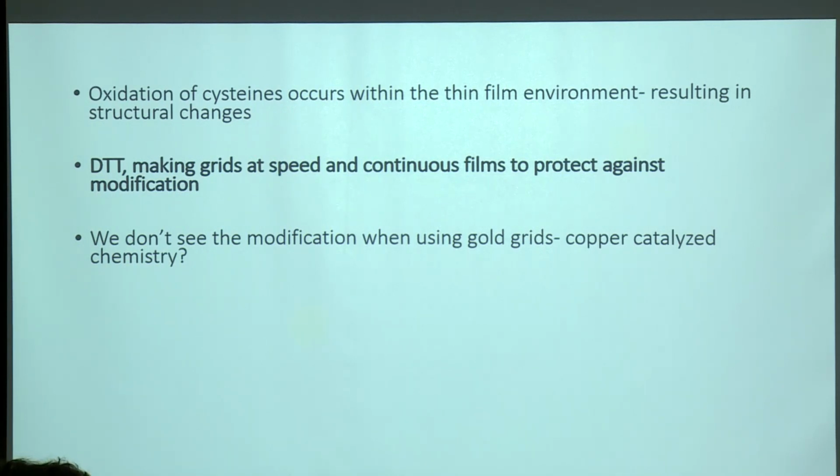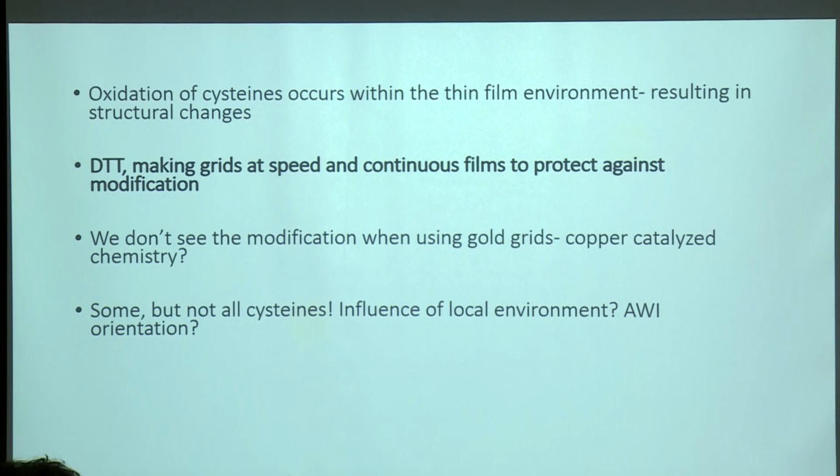We're pretty confident now that this is copper-catalyzed chemistry, but we're processing some data at the moment to really start to pin that down. And one thing that I haven't really spoken about so far: I've been showing you results for specific cysteine residues where we seem to see this impact.